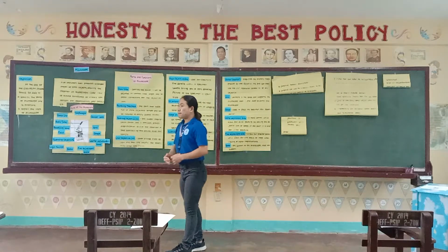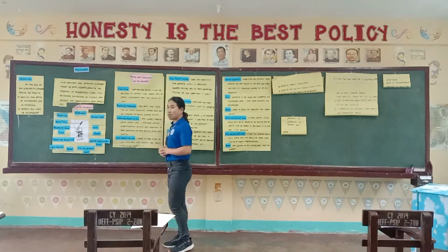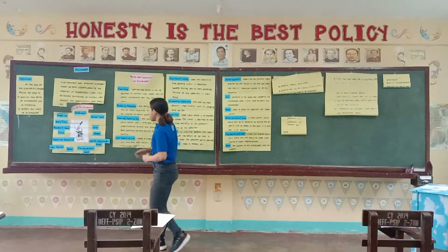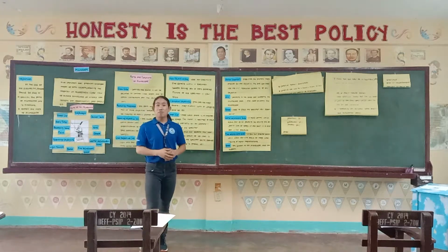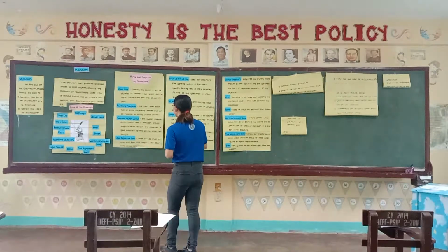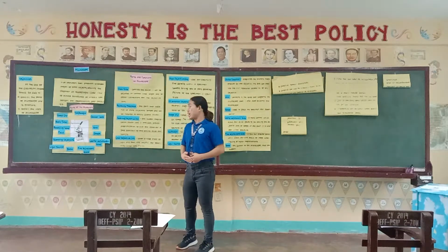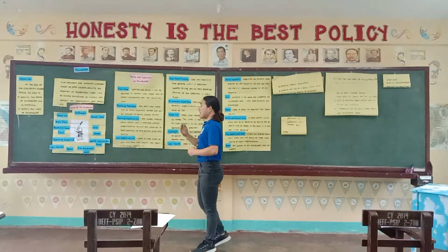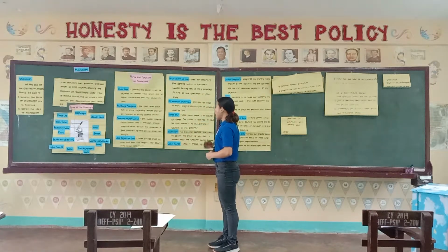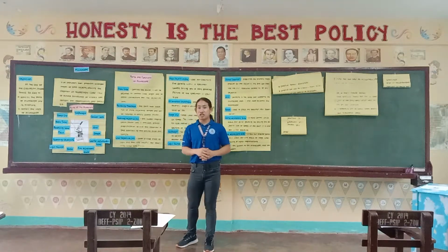Miss Arancon, could you please identify over here which part is the scanning objective? Okay, thank you. This one here is the scanning objective, which is composed of different lenses. The scanning objective has 4 times magnification, so it has the lowest magnification power, and it provides enough magnification to give the observer a good overview of the entire slide and sample, meaning that this scanning objective has a 4 times magnification power.